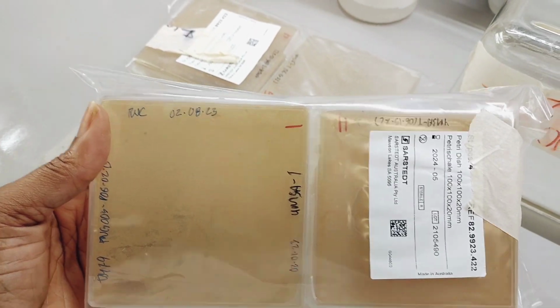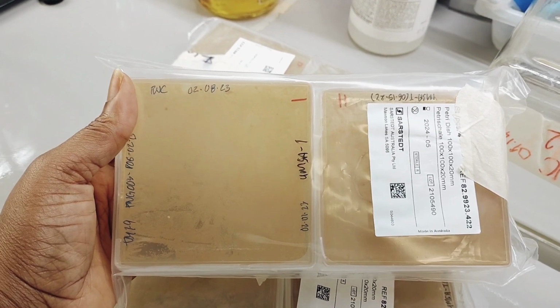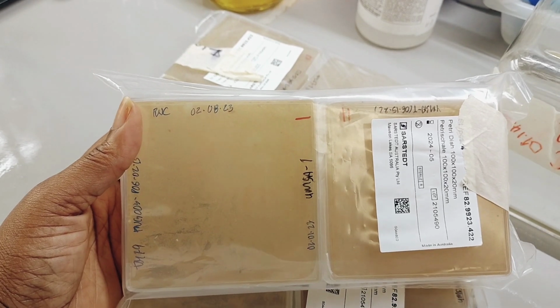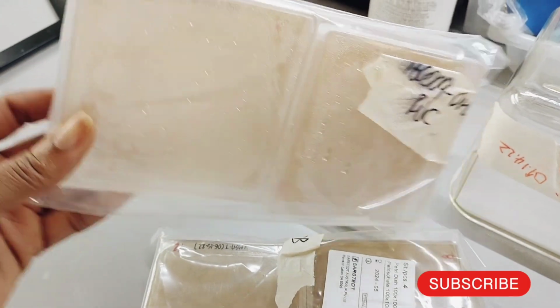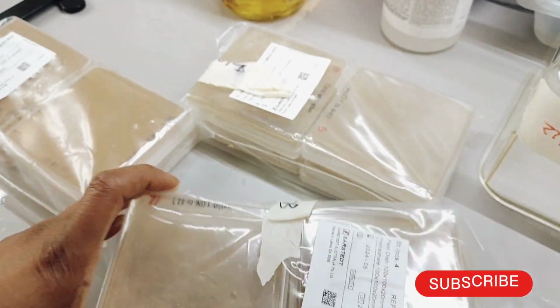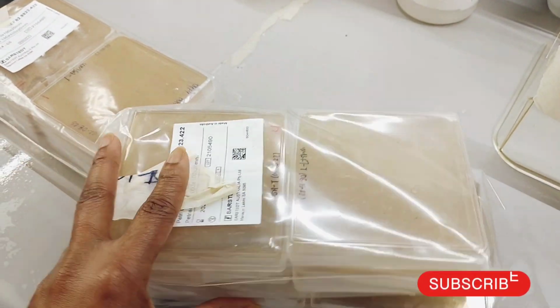Once I'm in the BSC, I'll give you a better look at it, but it's peachish, pinkish, and that's what the pathogen looks like when grown on nutrient-rich agar. It grows as yeast-like cells, and so that is great. I don't see any signs of contamination. It's just one type, so that is good, and I'm excited.